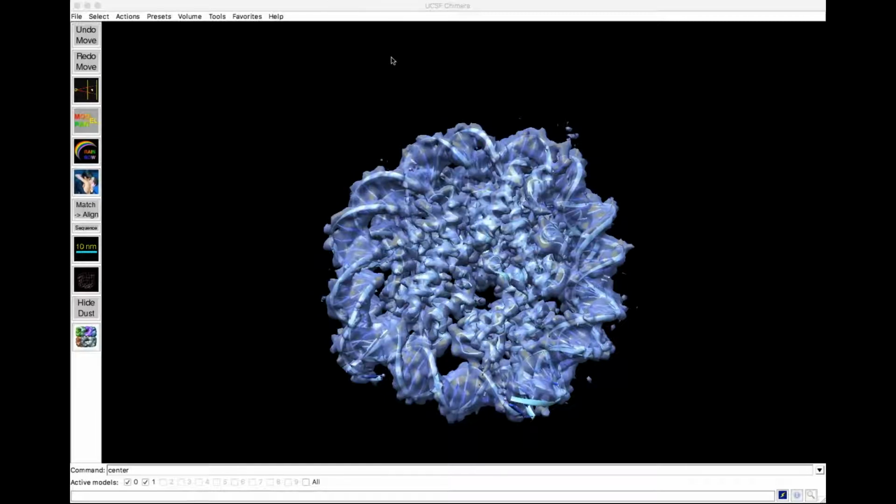All right, was everybody able to fit a structure into the map? Does anybody need any help with that step? So I'll say we have this optional step 11, if you want, you're welcome to load this other PDB that I recommended and try and fit it in and see how well it fits. I'm going to just skip that and continue onward to part 2.